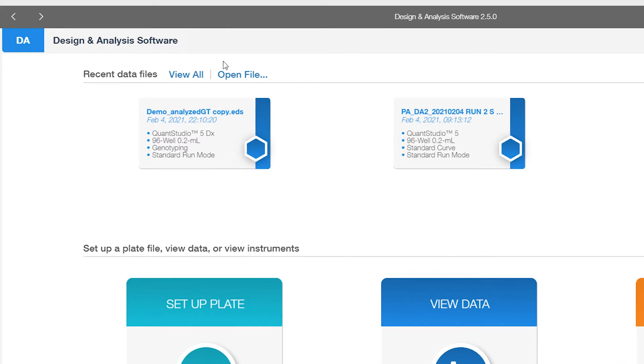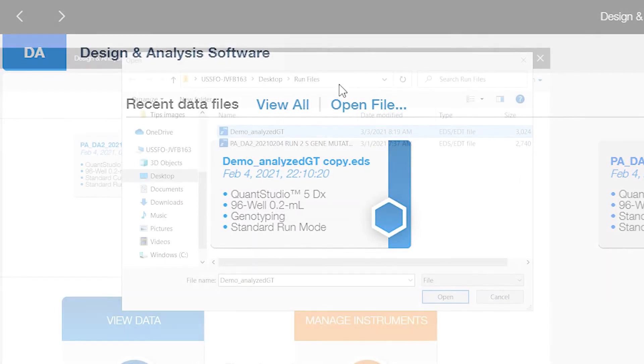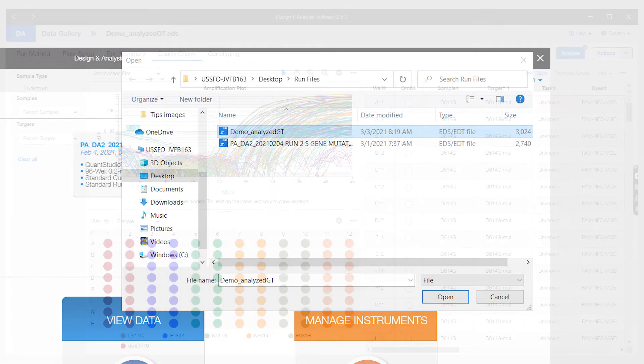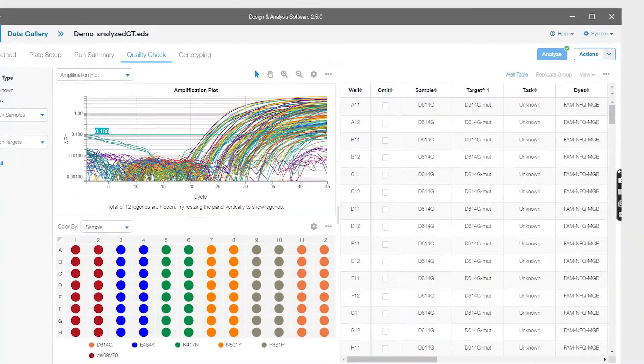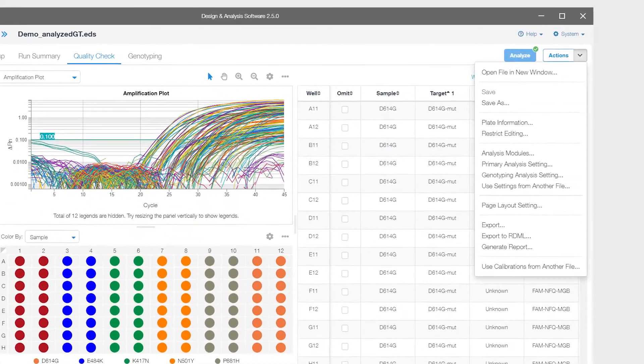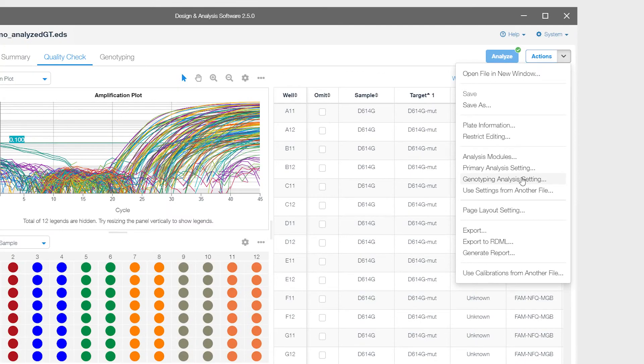Import your run files by clicking on Open File. Browse to where your file is saved and open it. To begin, select the drop-down arrow on the Actions button and choose Genotyping Analysis Settings from the menu.